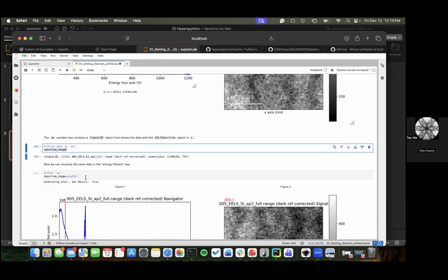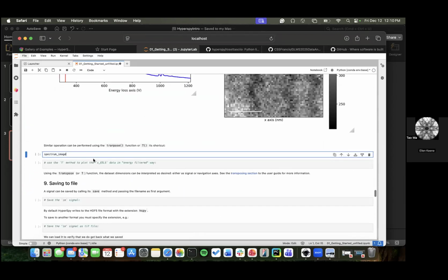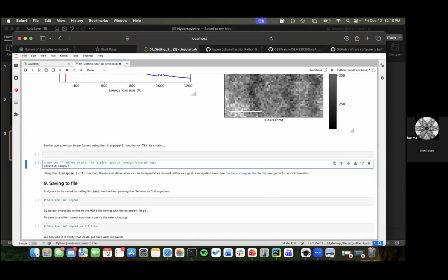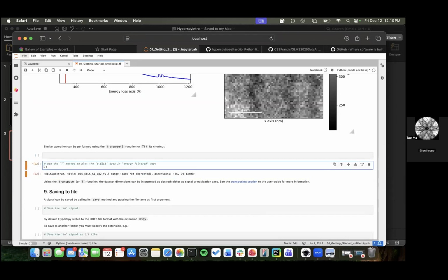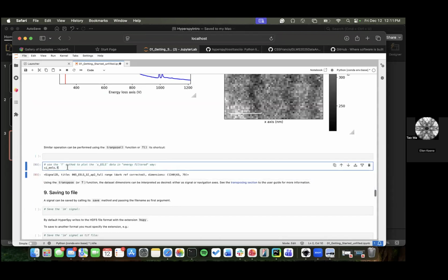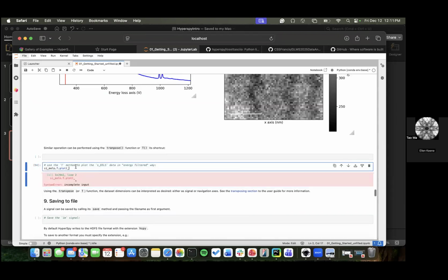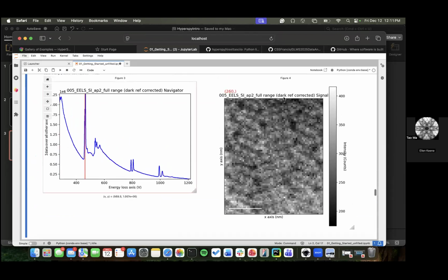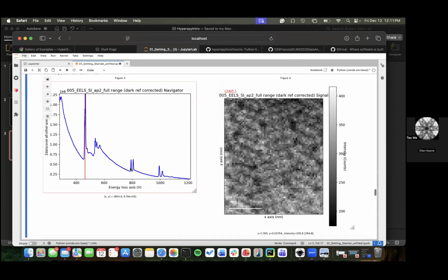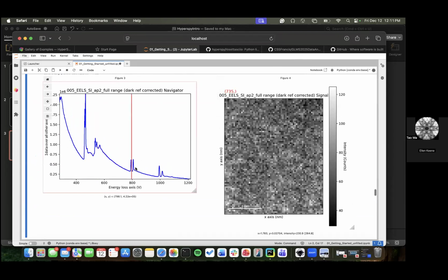We can also do the same thing with the transpose function. If we use .t, spectrum image .t, we can see now that we've got this. Oh, sorry, this is the spectrum image. If we take the silicon EELS and do .t, it's basically the same, and we can plot this. So we can chain this together, make this and plot it same as before. Now we can see our different channels.